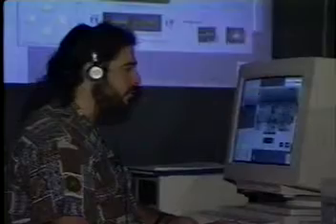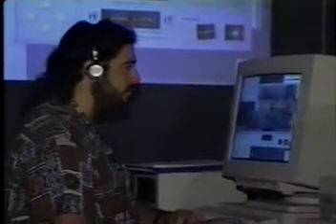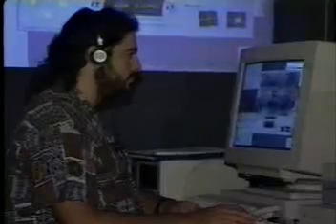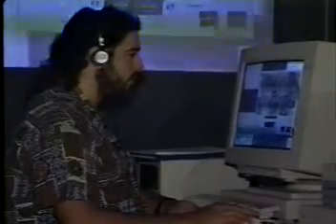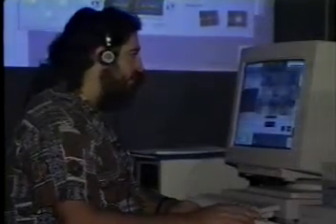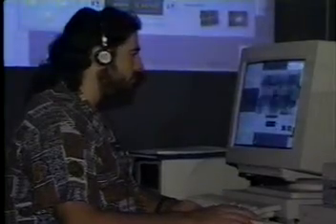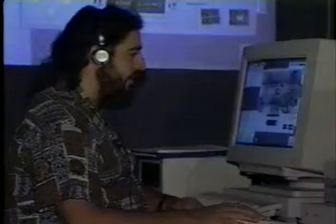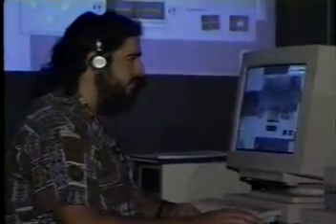Do you have a recommended magnification? I'm set at 4KX. I would suggest 5K. Okay, I'll change my magnification. Roger. It looks good here. Can I go ahead and transmit the request? Go ahead. Request transmitted. All right.